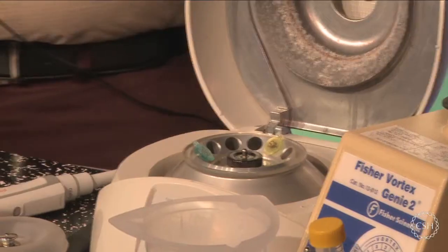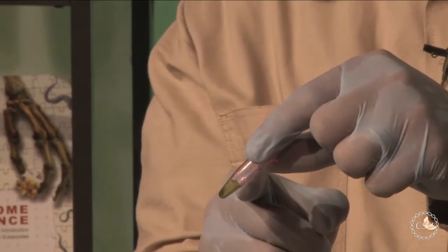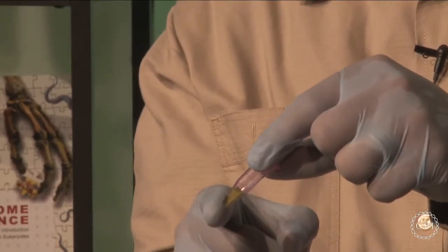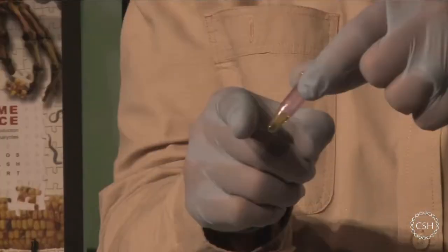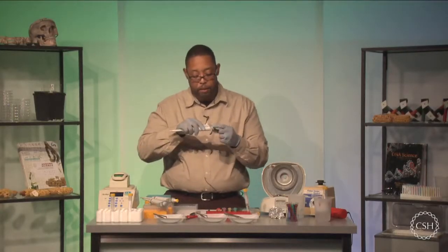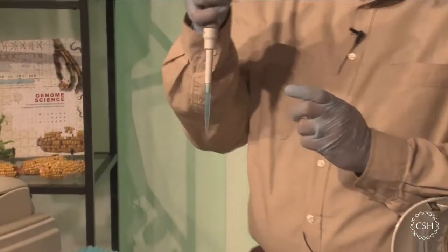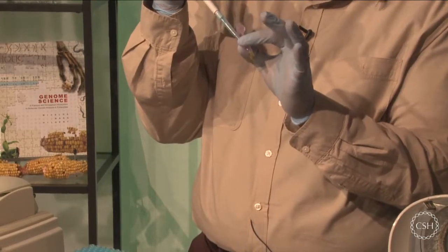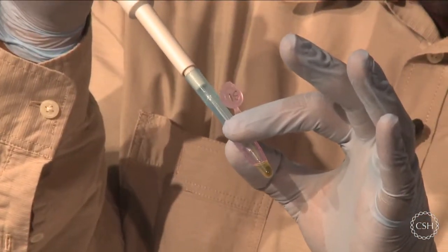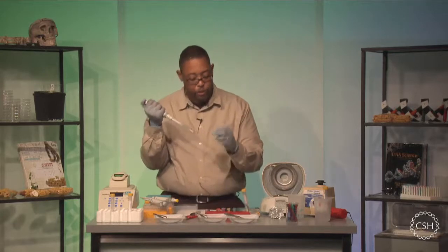So I'm going to take my first test tube out, and this is my sample number one, and I only want to take 150 microliters of the clear lysate, which is here. So you can see the debris at the bottom that we mentioned previously. And you can see the supernatant, which is clear on the top. Now it's not going to be completely clear, but it's actually free of debris. I'm going to grab 150 microliters of that. So I'm going to set my pipetter to 150 microliters, and I'm going to transfer 150 microliters of this lysate into a fresh test tube. Now be sure not to disturb the pellet at the bottom, because we don't want any of that debris. And I'm going to add this to a fresh test tube.